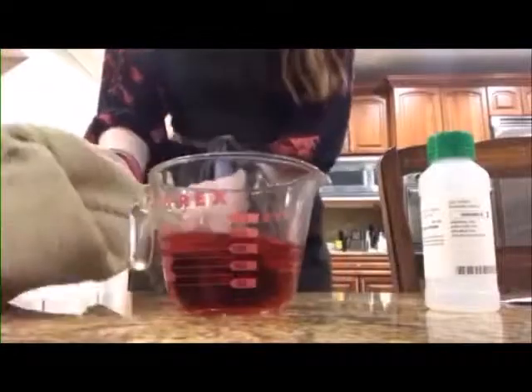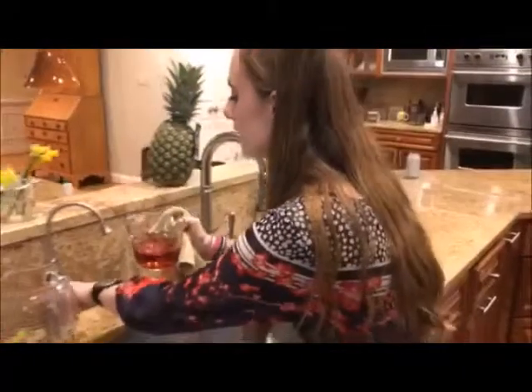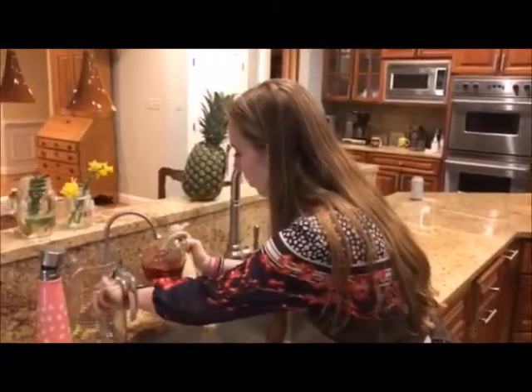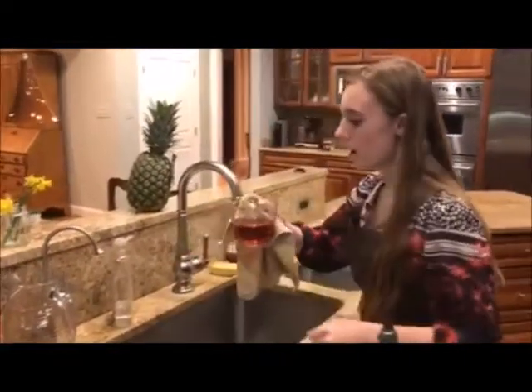Always remember to take proper safety precautions when dealing with chemicals. Using the same safety precautions as before, I'm going to fill the boiling ruby gold colloid back up to the 200 line. Then I'm just going to let it sit and wait.